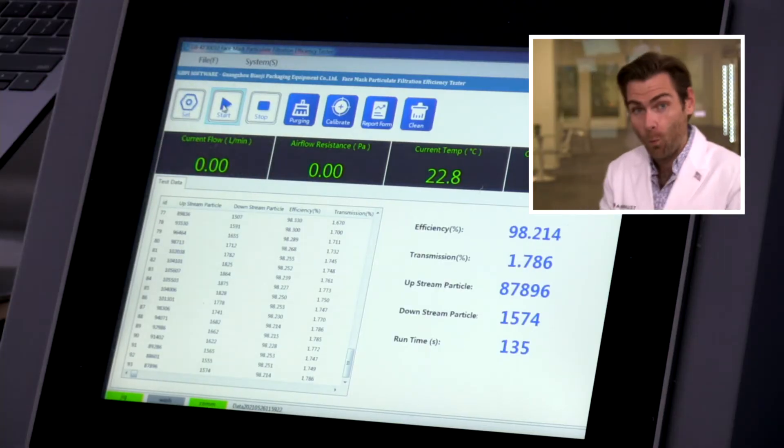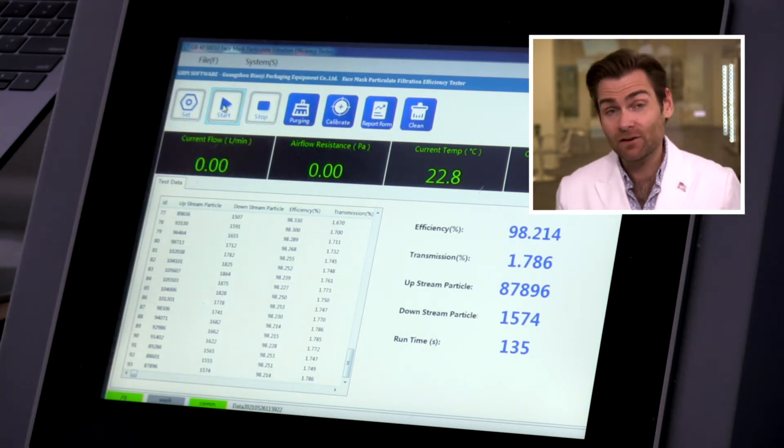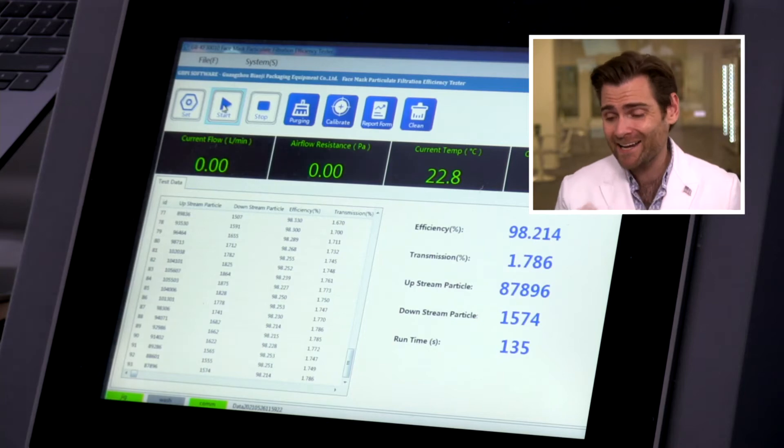Hell yes it does! Wow, this is an impressive mask — shocker of the day. 98.214% filtration efficiency. Great job, Safety Pro! I looked this thing up all over the internet and only found one random website selling it, but what a great mask — who'd have thought? The breathability is pretty good too: 85.24. So great breathability and great protection. This could be an ASTM level three mask if they wanted it to be.